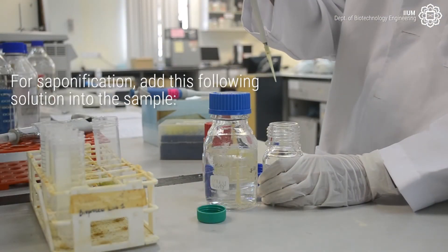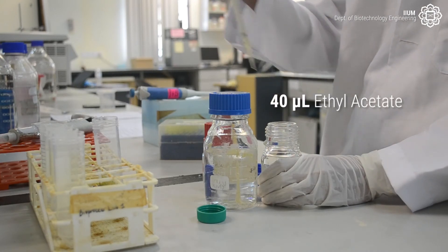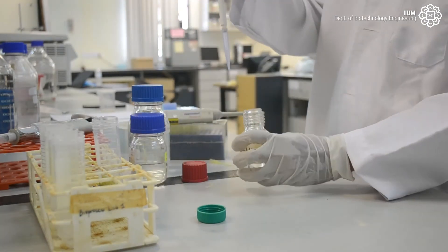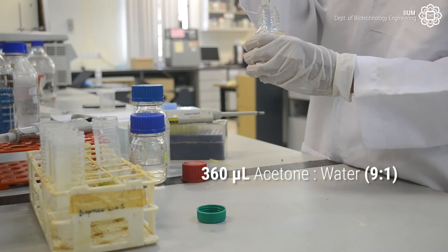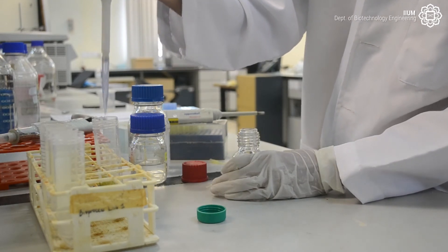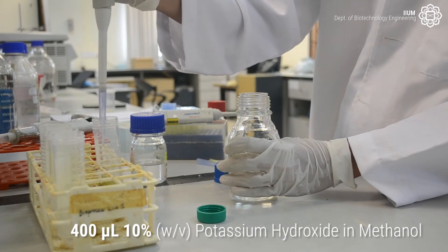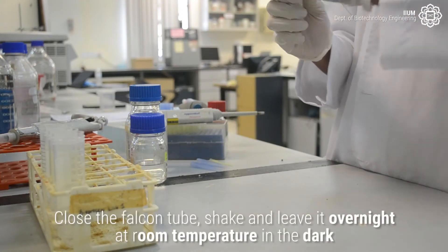For saponification, add the following solutions into the sample: 40 µL ethyl acetate, 360 µL acetone and water at a ratio of 9 to 1, and 400 µL of 10% weight over volume potassium hydroxide in methanol. Close the falcon tube.